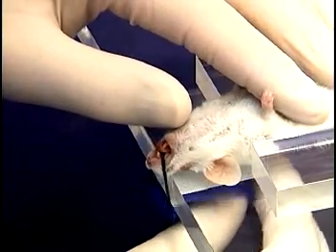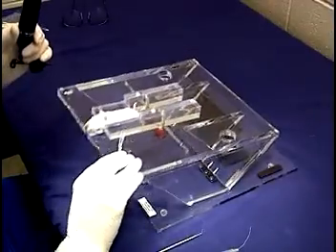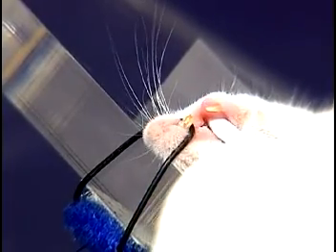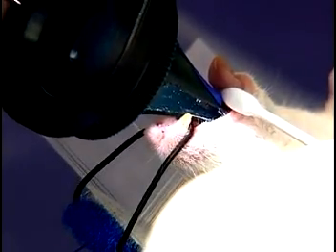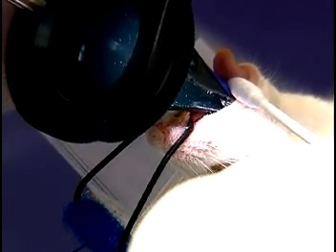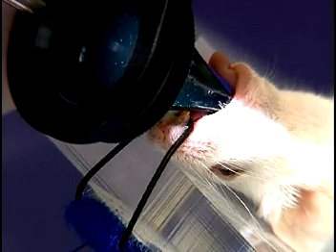The incisor loop is applied and secured to the stand, and the stand is tilted to 45 degrees. A small cotton swab is placed under the tongue and rotated towards the operator to extend the tongue and lift the mandible. With your elbow resting on the bench and your hand braced against the stand, the speculum is slowly and gently inserted parallel to the hard palate and carefully elevated until a clear view of the cords is obtained. The otoscope may be lifted or lowered slightly to improve the view as needed, but should remain parallel to the stand and should not be rocked or rotated up and down in an attempt to improve the view.